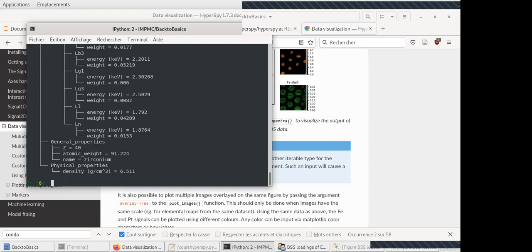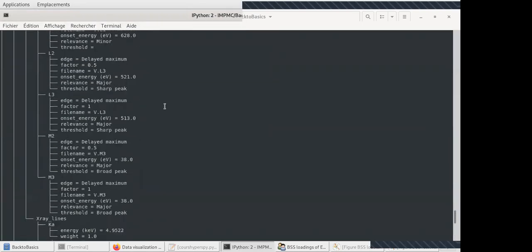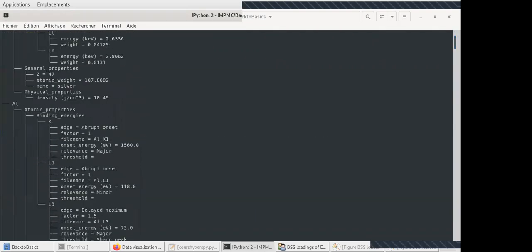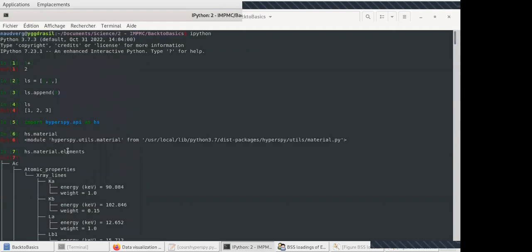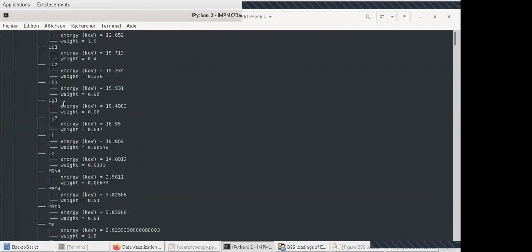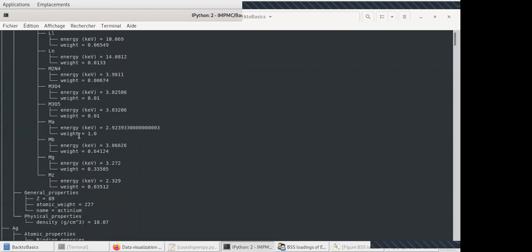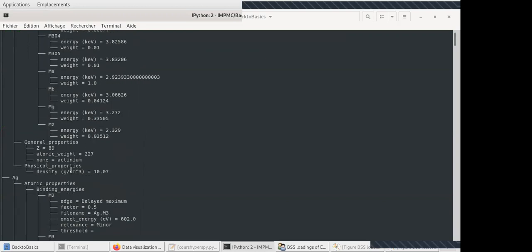I worked on really tiny materials — objects only a few pixels in size — and instead of selecting areas by hand, I automatically identify bright points, extract them, sum the energy, and show what the spectrum looks like. There's also the database for the elements — in 'materials.elements' — sorted alphabetically. You have the different lines and values, and you can modify those values if needed.